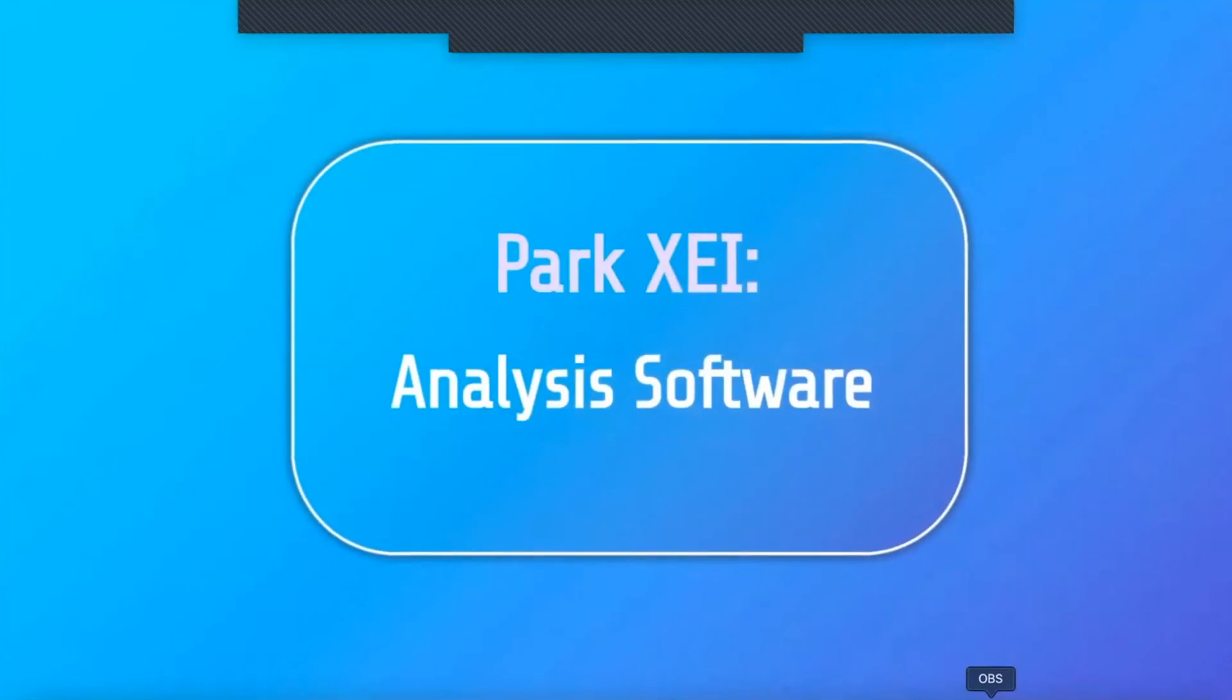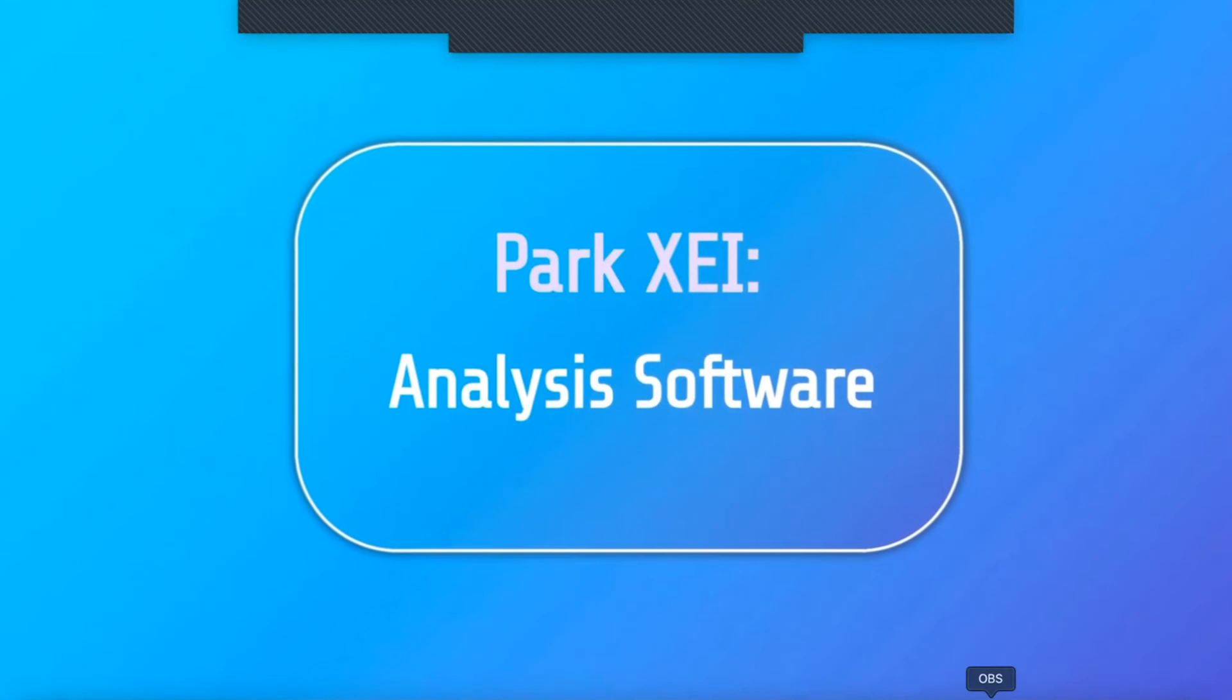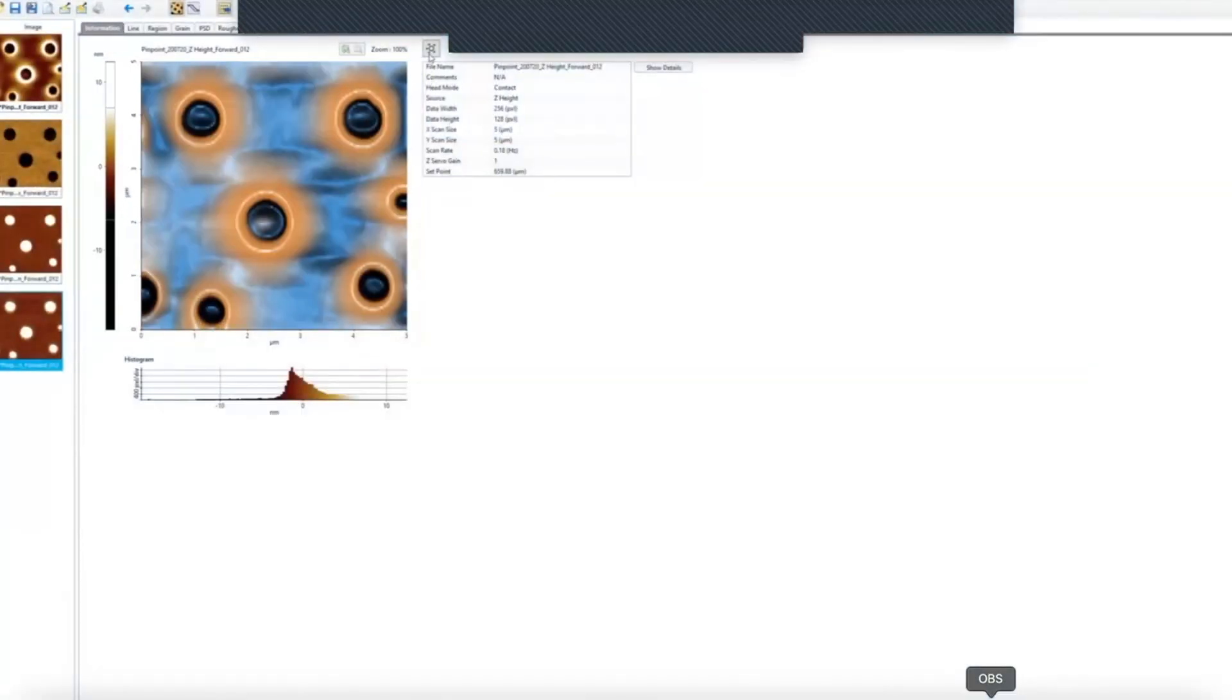When the scan is finished, you can analyze the data using Park XEI, an analysis software. In XEI, you can open and review any of the measured channels. Let's take the height as an example.